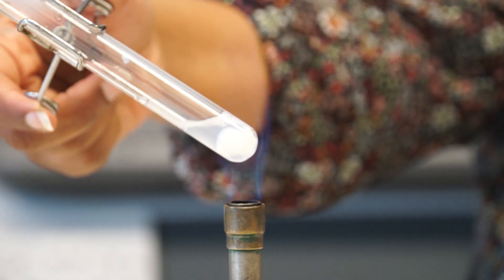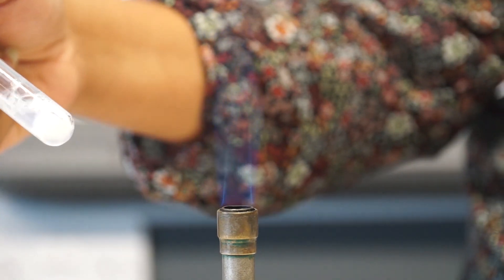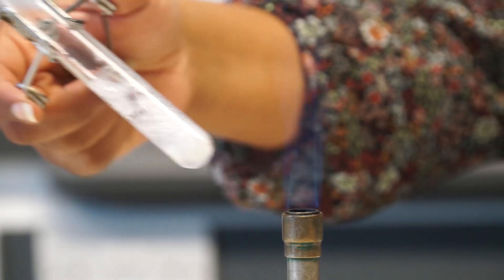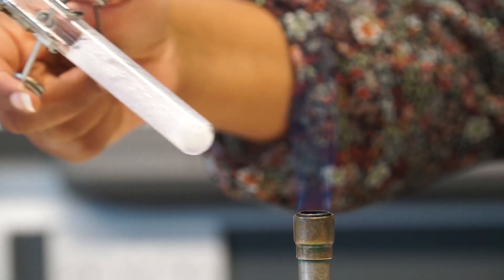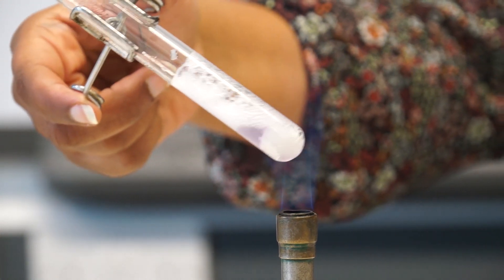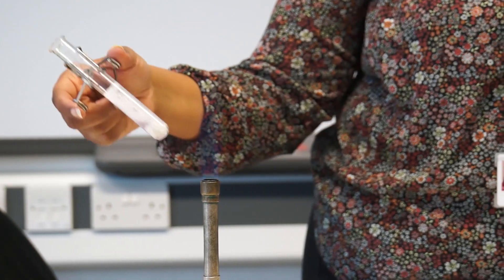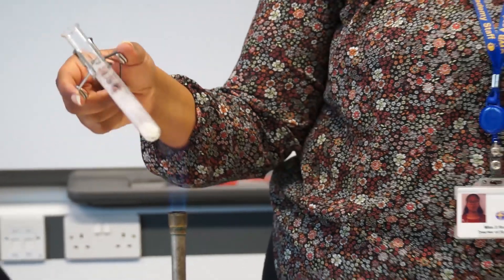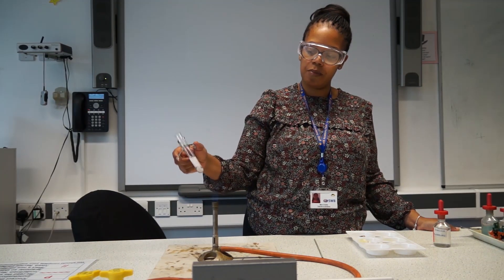Ideally, when you're doing this in class, you will use a water bath because these chemicals are quite volatile. And you can see in my Bunsen burner it looks quite aggressive. You can see that colour change happening now — you can see a purple colour. And that's a positive test for the presence of protein.